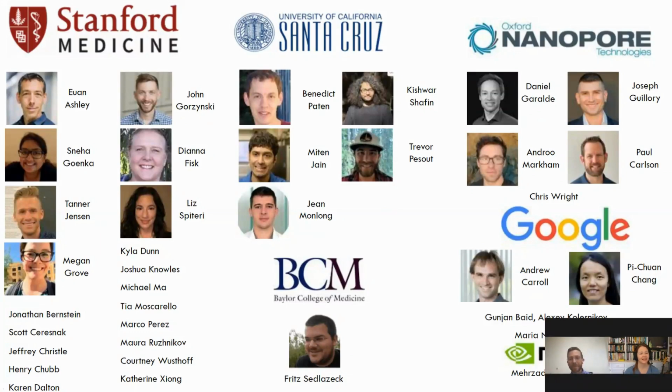Great. Next question. Do you think Nanopore could be used for circulating tumor cells, so using whole genome amplification protocols on single cells? Yeah, so that's similar to the previous question in terms of single cell sequencing. In our lab, we have tried to do genome amplification from single cells in order to sequence single cells. It didn't work really that great, to be honest. This was a few years ago, though, so the technology wasn't at the point that it is now.